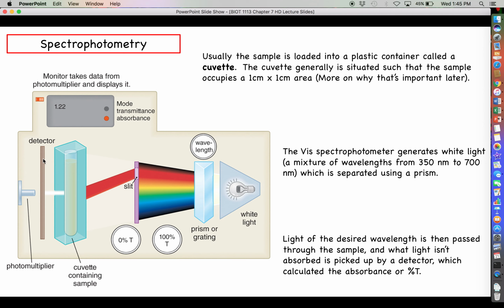But the other issue with this, if you were asking, okay, so we just did the Bradford assay to measure protein concentration, we had to go through the whole rigmarole of making a standard curve, then we had to do all these calculations, we had to do all this nonsense in Microsoft Excel, plug our absorbances into the linear regression formula that we generated. It was a lot of hassle. So you're probably wondering, okay, why can't we just do this for protein? Why do we have to bother with the whole Bradford issue?